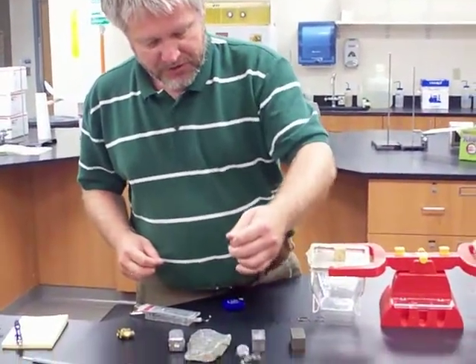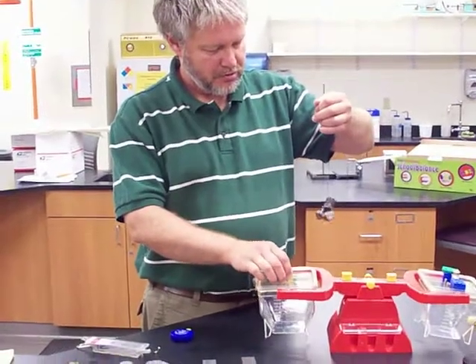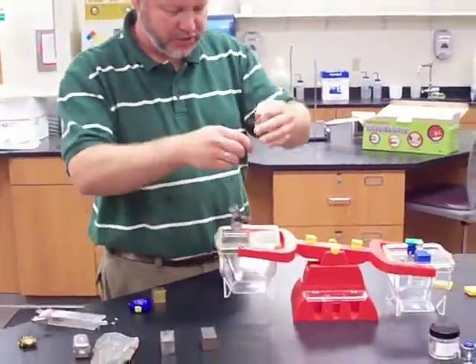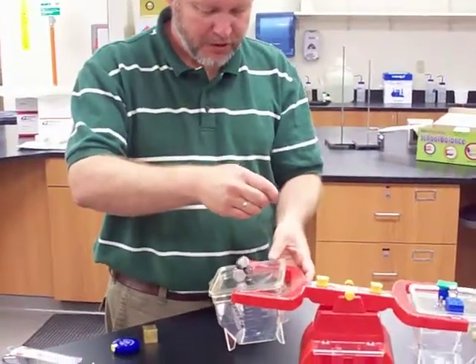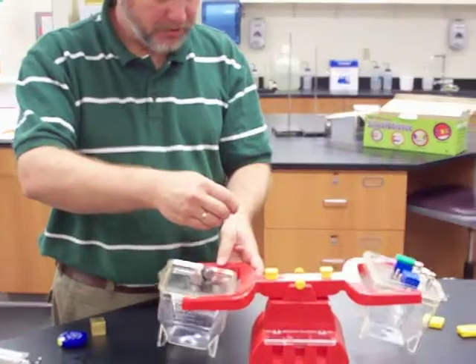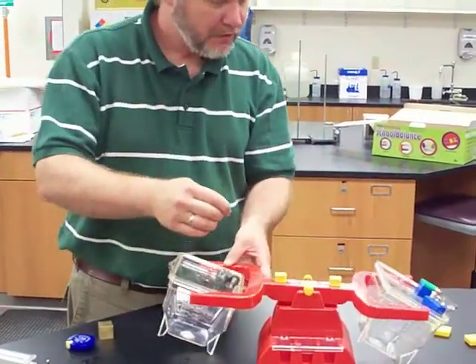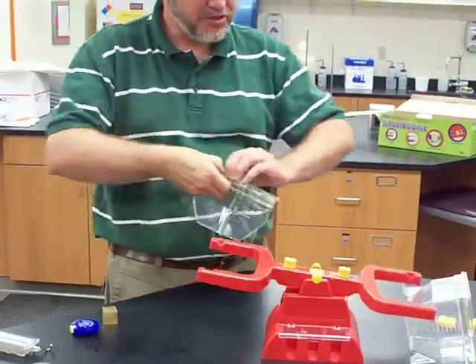The other ones are these steel screws. That's the object that has an irregular shape, so I cannot measure the dimensions, but I have to do something else in a moment. First, I'm just going to determine the mass, and everything slides, and I think I'm going to do it differently. Again, you can just keep filming.